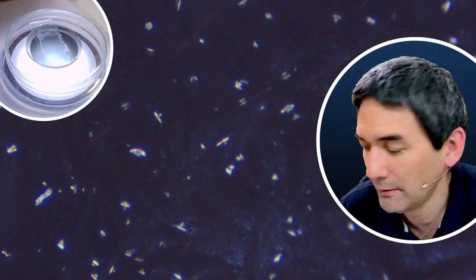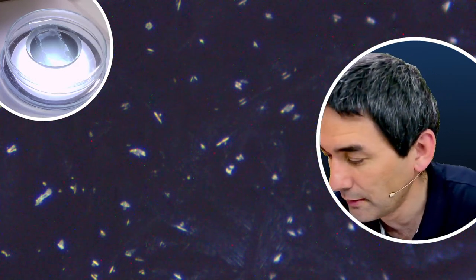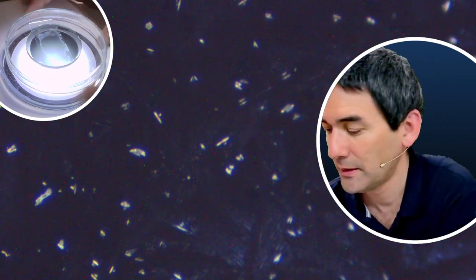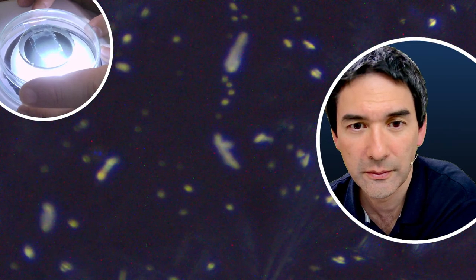Look, something's happening. Okay, the crystals are still very fine. Okay. Yeah, I still see it's not completely dry. So maybe, I don't know, it's very slow. I'm going to carefully move it down. Maybe there's a little bit more happening over here. Yeah, you see over here, it's already started to crystallize.